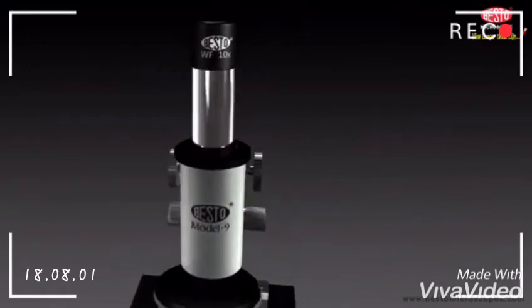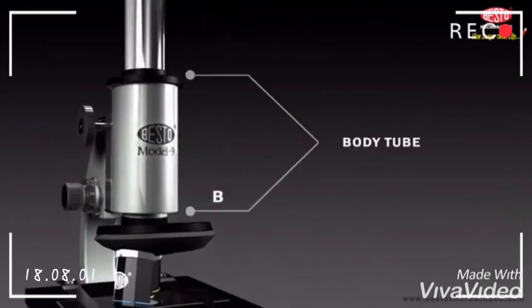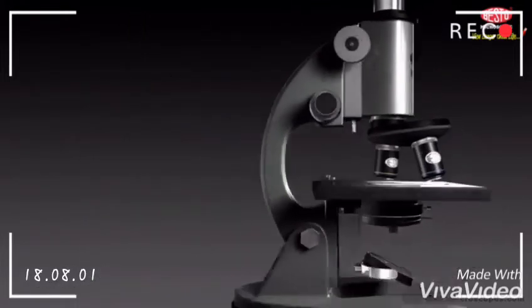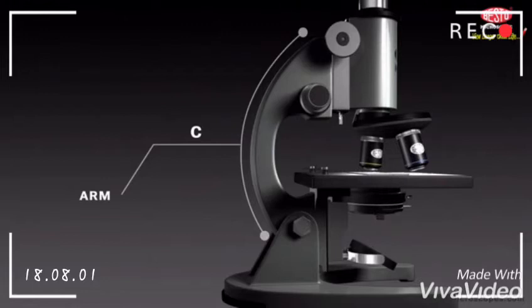The body tube holds the eyepiece in position over the revolving nose piece and the objectives. The body tube may be straight up and down or slanted. The arm is the curved metal piece that holds the body tube in place over the stage and the base.